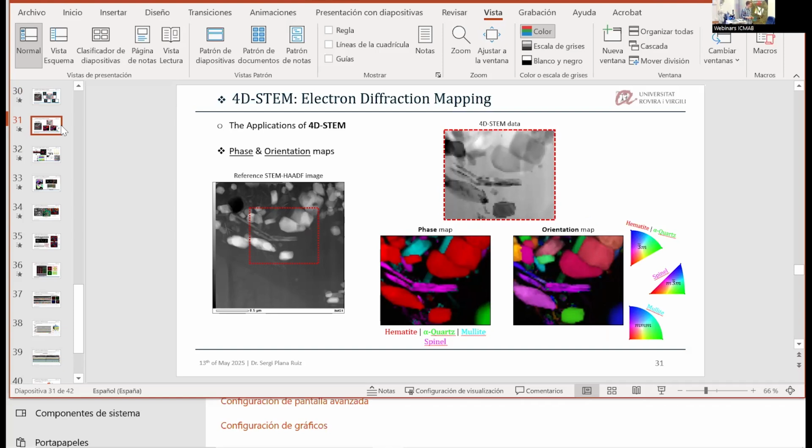It's a program, not a database. It's not like in X-ray, where the spots don't belong to a zone. And then it's done automatically.